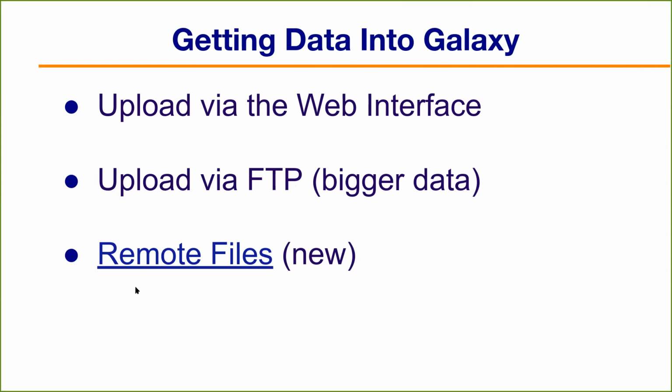from the FTP server. And there's a new interface called remote files. I've linked to a talk on how this works. If I have some time, I will show a demo of this, and that's basically looking into how to link Galaxy to remote resources. There's some experimental work on linking Galaxy to Dropbox, but also, you know, that you can browse, for instance, the NCBI website, or sorry, FTP sites, and collect data from there. But this remote files feature is in development.